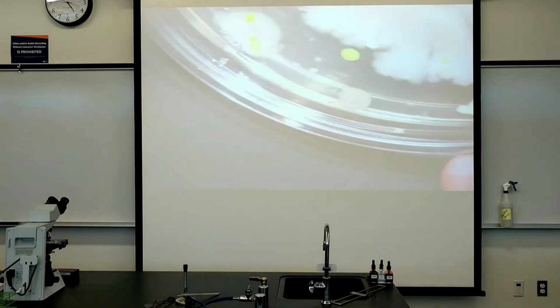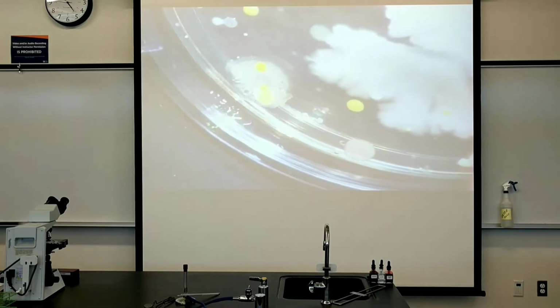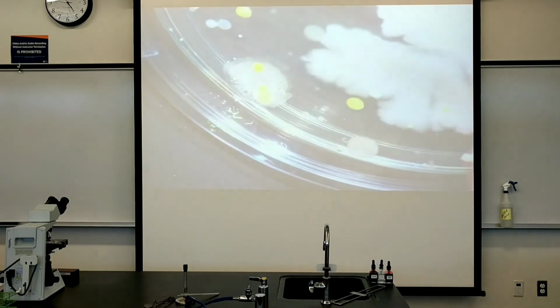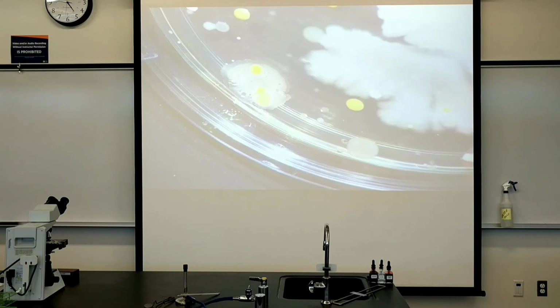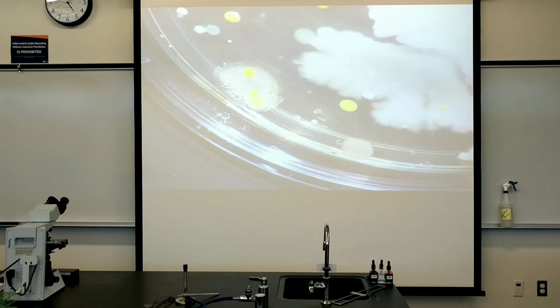I mean, there aren't really many that look fuzzy. That particular one there might be a mold. It has some striations, and it's a little tough to tell, but I suspect that that's fungi. And the way that I could tell you if that's fungi for sure is to put a sample of it under the microscope. Right now we're just going on colony appearance.